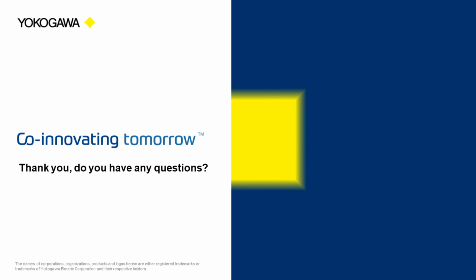I can contribute to this one here too, Adrian, just to clarify. The SS2000, like Kyle said, does have an incubator which can keep the cells in culture, which you are going to be imaging and sampling from, alive for long periods of time. Now, if you're going to use the SS2000 to go inside of the cell that is alive at the time of sampling and sample any subcellular material, you're going to kill the cell in the process as well.